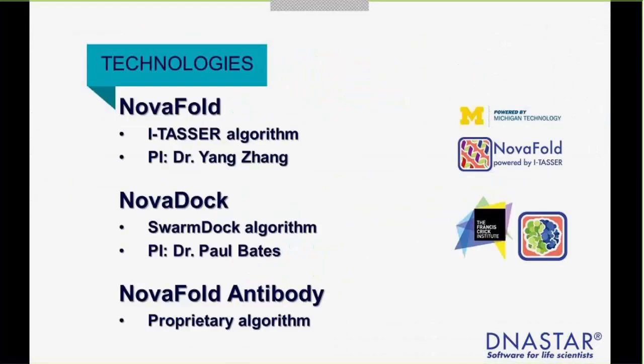We've licensed a number of critical pieces of intellectual property to help some of these Nova tools along. NovaFold is powered by the I-TASSER algorithm from the University of Michigan. The principal investigator behind that work is Dr. Yang Zhang. NovaDock is based upon the SwarmDock algorithm from the Francis Crick Institute and formerly Cancer Research UK.